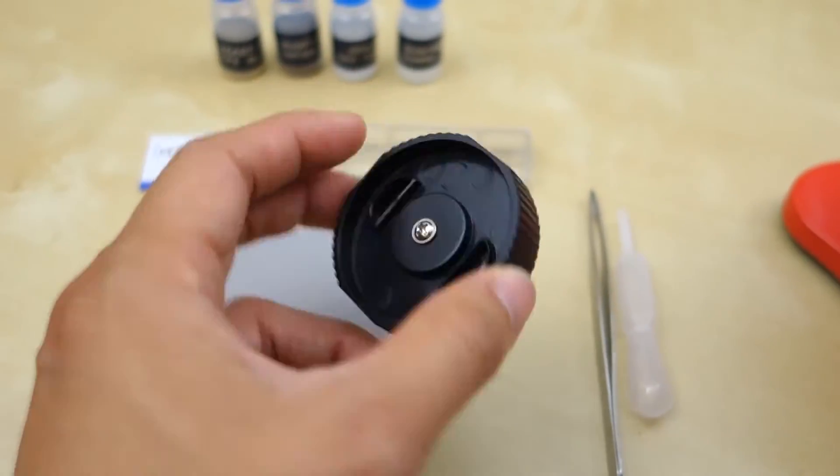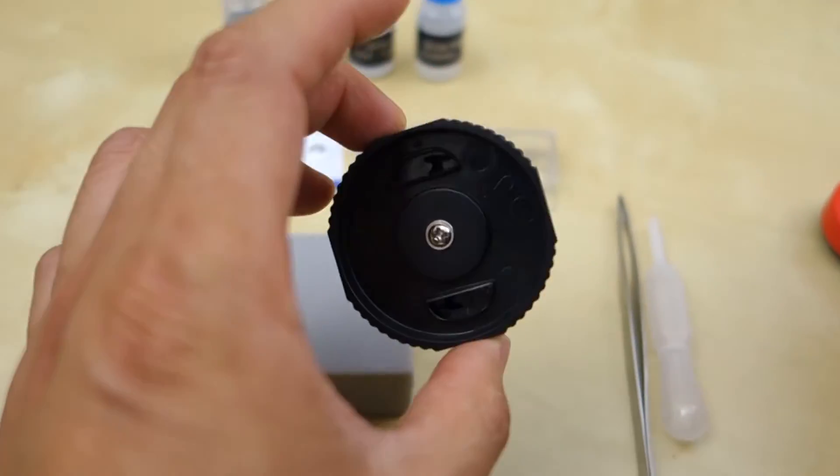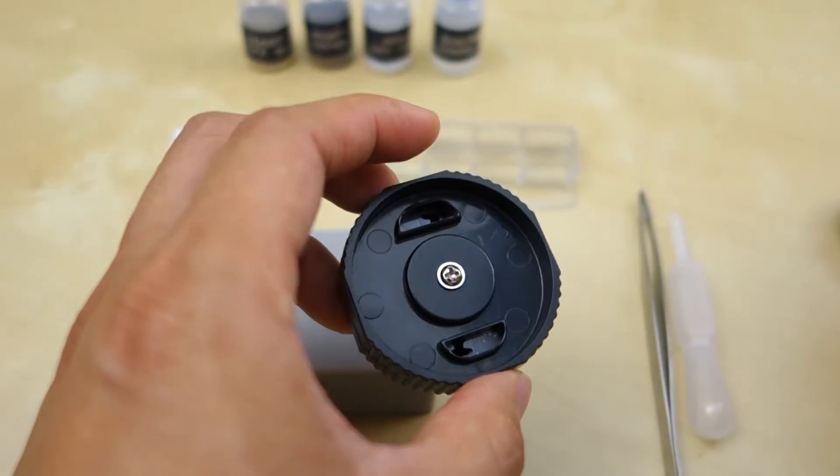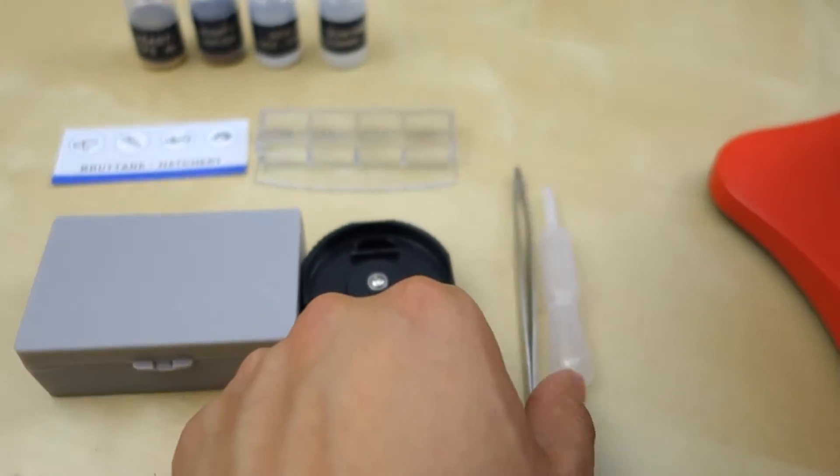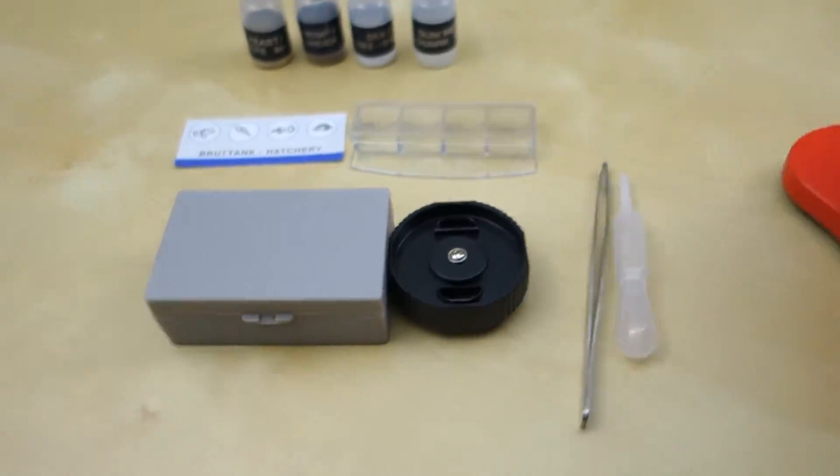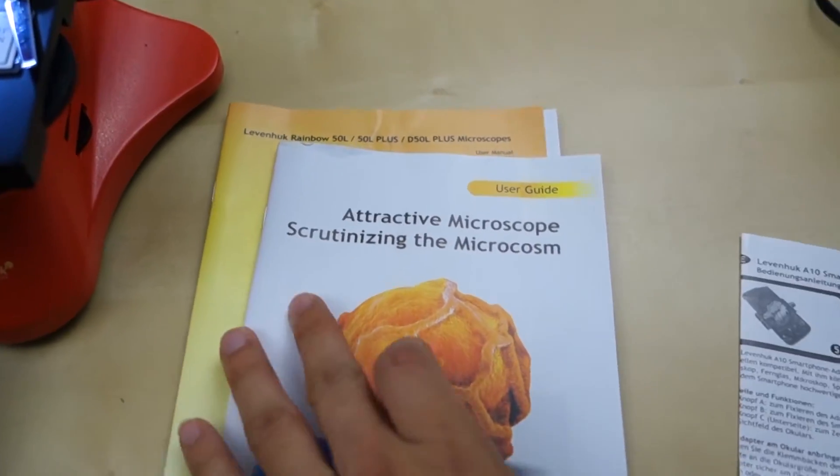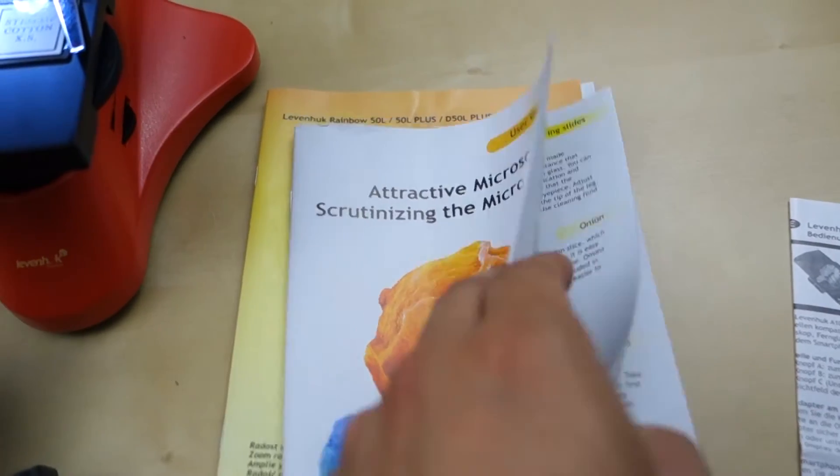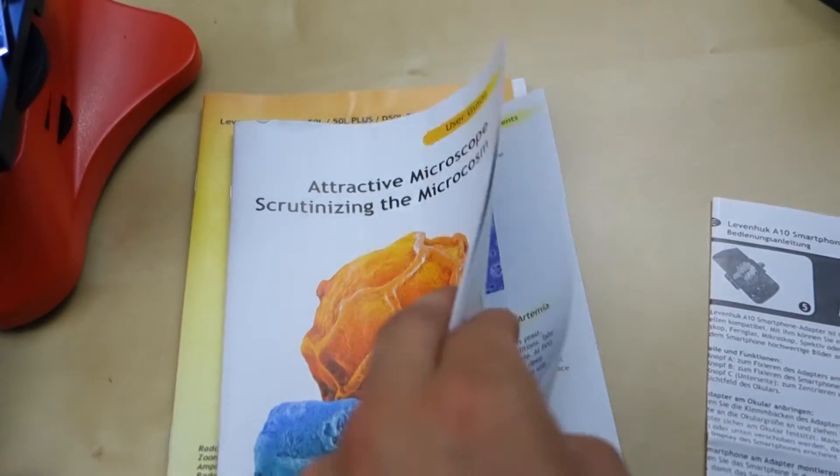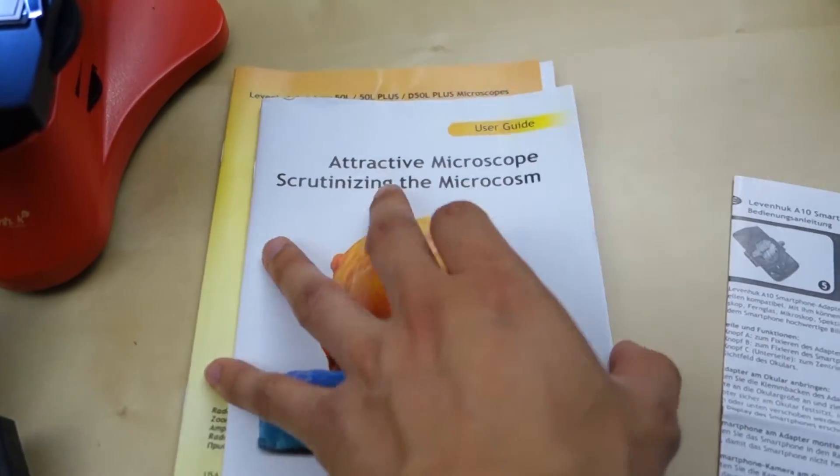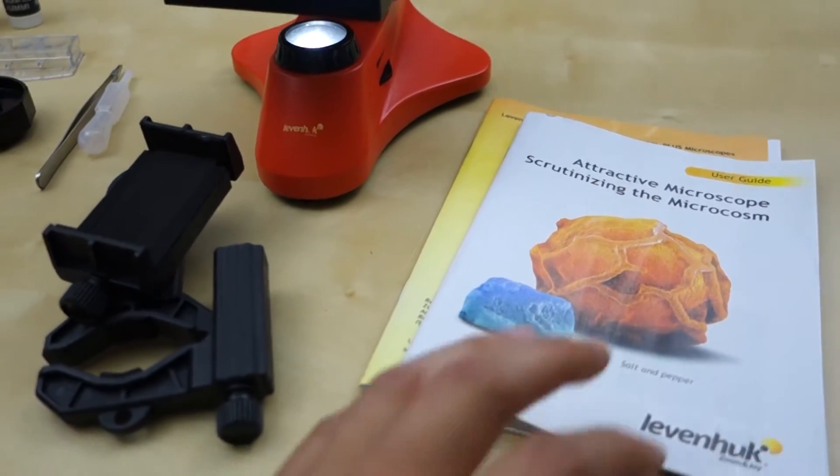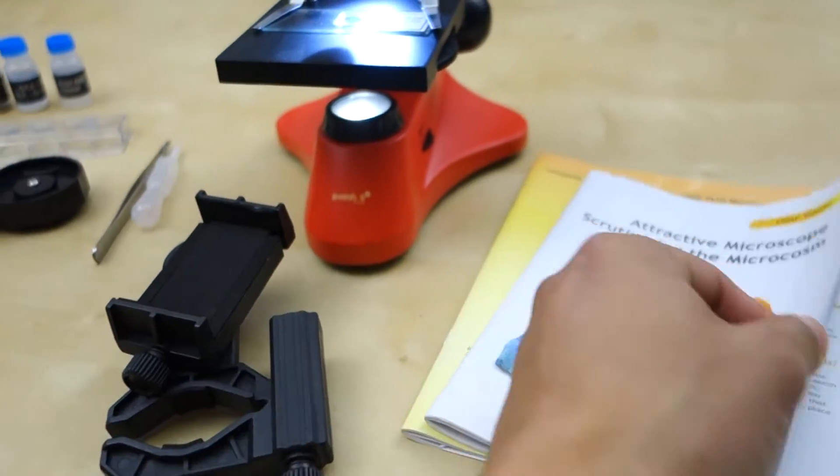You have this microtome that's designed to scrape up live organic material and put it on the slide. And then you got a pair of tweezers, a little water dropper. And then you have the user manual along with the little instruction menu here. And in this thing, it gives you a lot of information. So it's definitely an educational product. So I guess this is geared toward children and anyone who really wanted to learn about microscope.